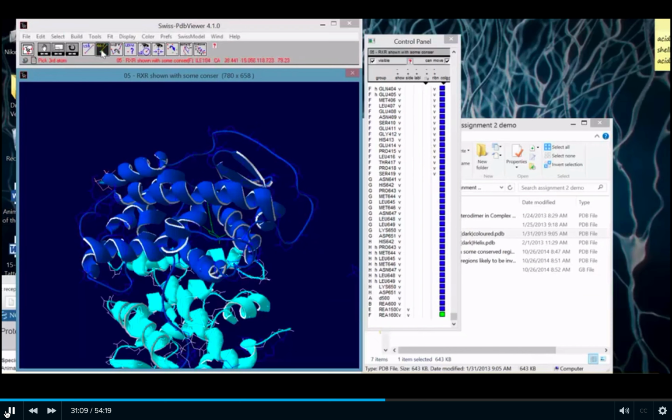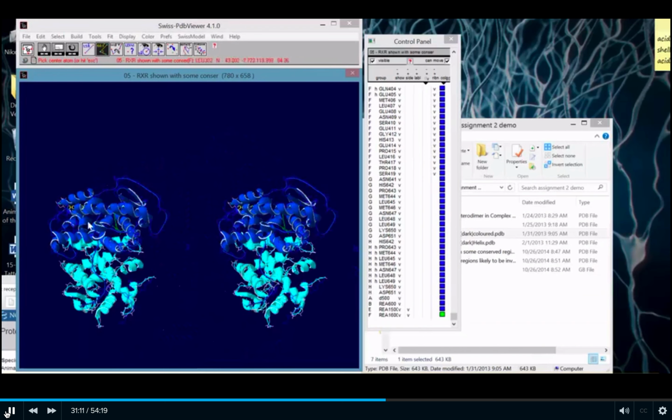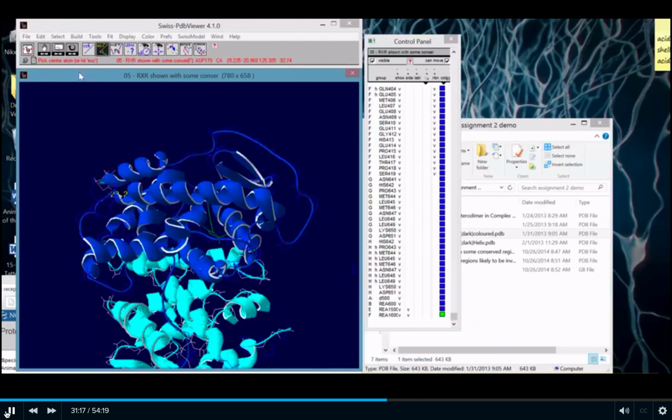So if I click different residues, and you have to actually click the atoms here, you can actually get different angles of alignments here. So if I click this, this gives me angles. So I go A to B to C, and I could actually get an angle between my 3 points. I could show a particular angle.